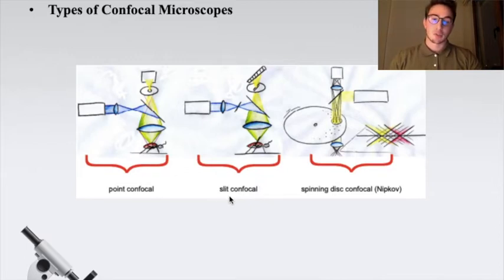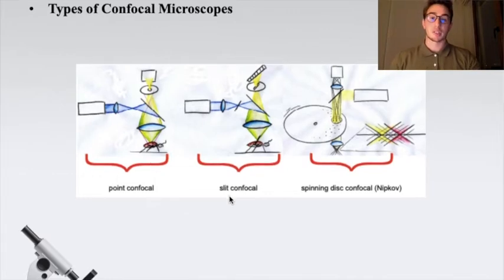Laser scanning scopes have high resolution and slow imaging frame rates, and spinning discs have high frame rates, which is advantageous in live cell imaging. When selecting a system, consider the ease of training users, the ability to adapt the system to future needs, and the expense to maintain and repair the system.